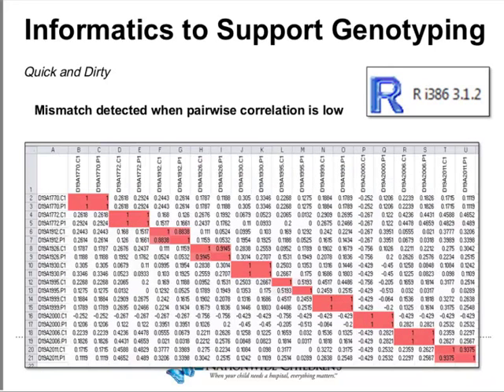So here, using this approach, I wanted to show you an example of what a mismatch looks like. So we've moved to a different set of patients. It's the same format where we're pairwise looking at the correlations. And as we move down, we hit here where now we don't have that nice grid of 4 where the correlation of genotypes is very high. When you go back into the raw data for this one, we actually do see there is a mismatch between these two samples. So this approach was able to identify that mismatch. That was one of the objectives: do tumor and normal submitted for a case match each other.